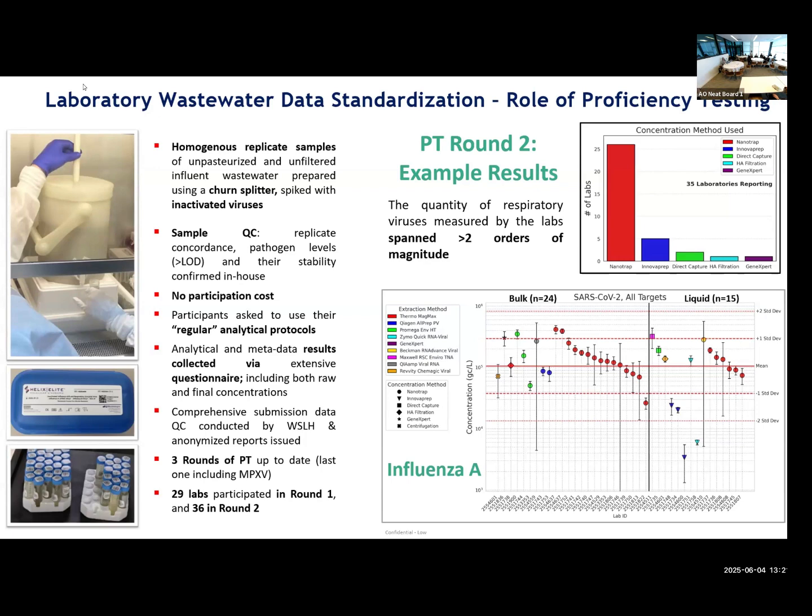And from that, hopefully over time, we could also provide information on how your laboratory is improving the process, if we're repeating the same pathogens with the same method over time. We're hoping that, as a community, and there are questions that we're going to talk about here on this panel today, we can learn how well our methods are performing at low levels, which is a lot of times what we're dealing with in wastewater.